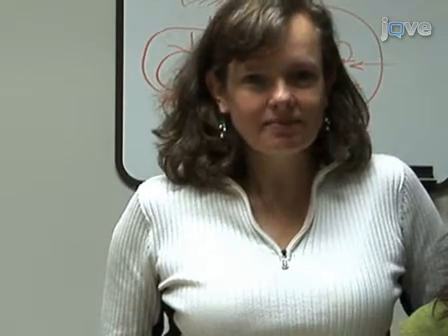Hilary and I are in the Division of Basic Science at the Fred Hutchinson Cancer Research Center in Seattle. Today we're going to be showing you a technique for making chimeric zebrafish embryos, also known as genetic mosaics. This procedure allows us to assess the cellular basis of gene function during development. We can ask whether a given gene functions within the cells with a mutant phenotype, known as cell autonomous function, or within those cells' environment, known as cell non-autonomy.